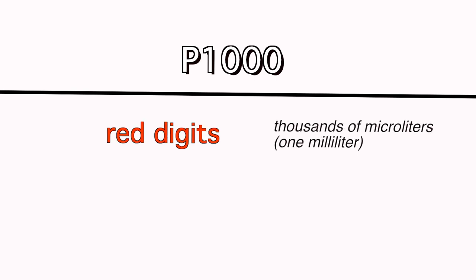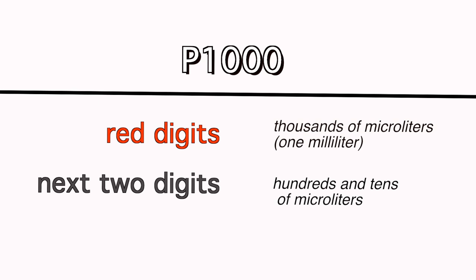For the P1000, the red digits refer to thousands of microliters, and this number should never exceed one since the maximum volume is 1,000 microliters, which is the same as one milliliter. The next two digits indicate hundreds and tens of microliters, while the red tick marks indicate single microliters.